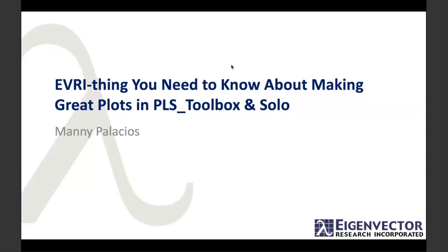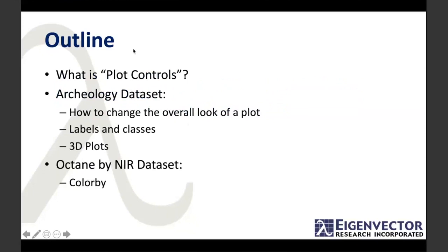Thank you, Barry. So, hello, everybody. Greetings from upstate New York. Today, we are going to be talking about everything that you need to know for making some great plots in the PLS Toolbox and Solo. So, a quick outline here. First, we're going to address what is plot controls. That is our main plot, our main GUI for plotting.